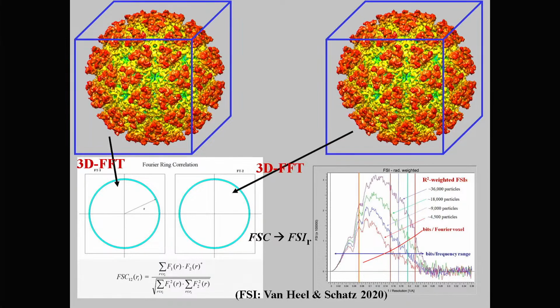You're integrating the total amount of information, and that's what you're after. You have a lot more information on beta sheets and alpha helices here, whereas it doesn't really show up here very much. But again, the threshold curve is always a curve, and you need a correct metric to integrate that information.